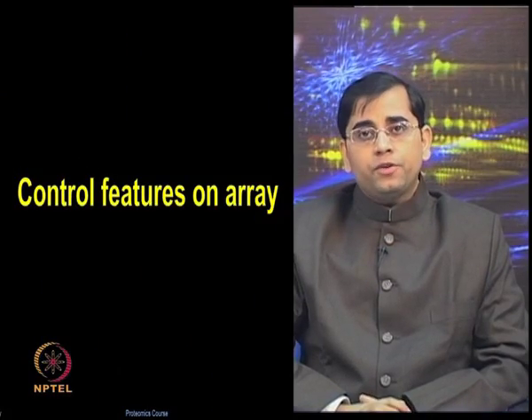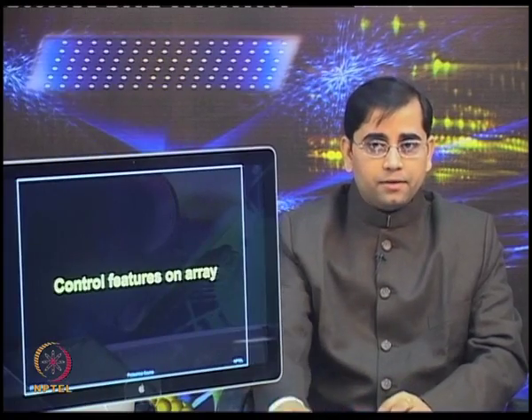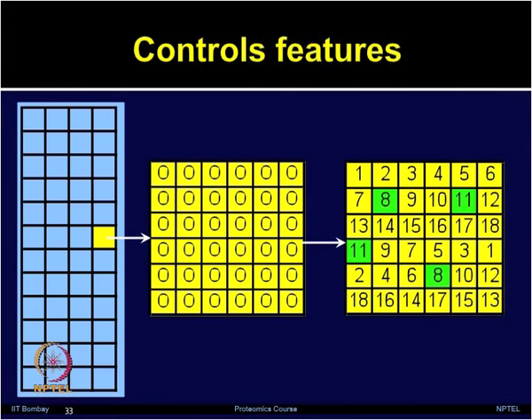So, what are the different types of control features you need to put on the array? Let us have a brief discussion on that. As briefly mentioned earlier, you need to ensure that different types of control features are spread across the array surface, and these could be mouse IgG, no DNA, non-spot, EBNA, human IgGs, etc.